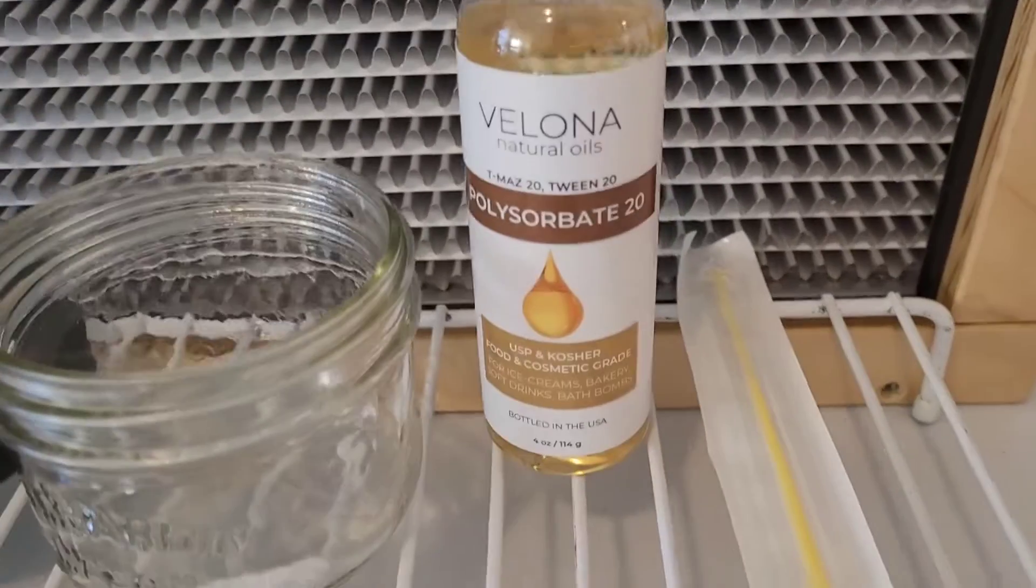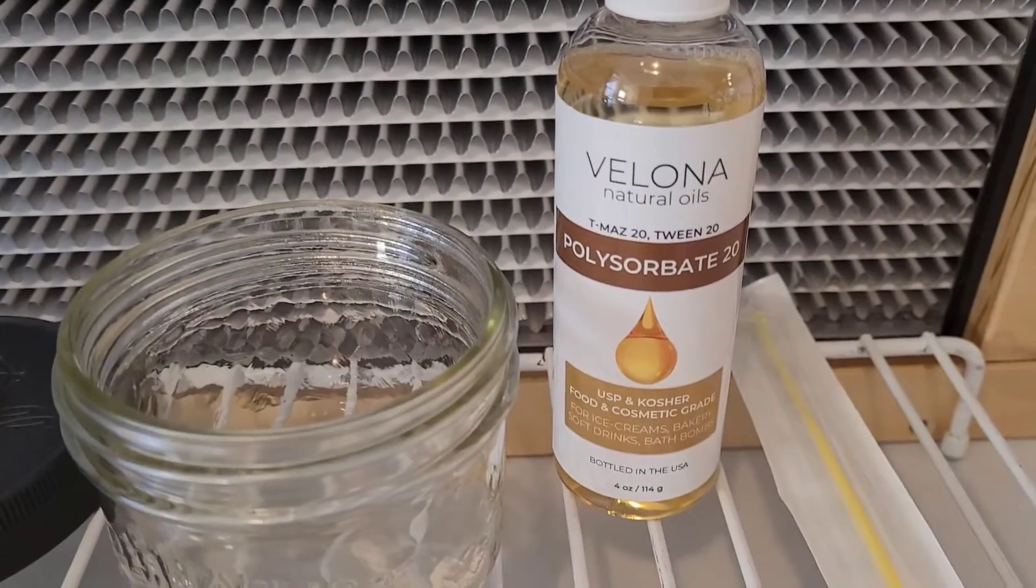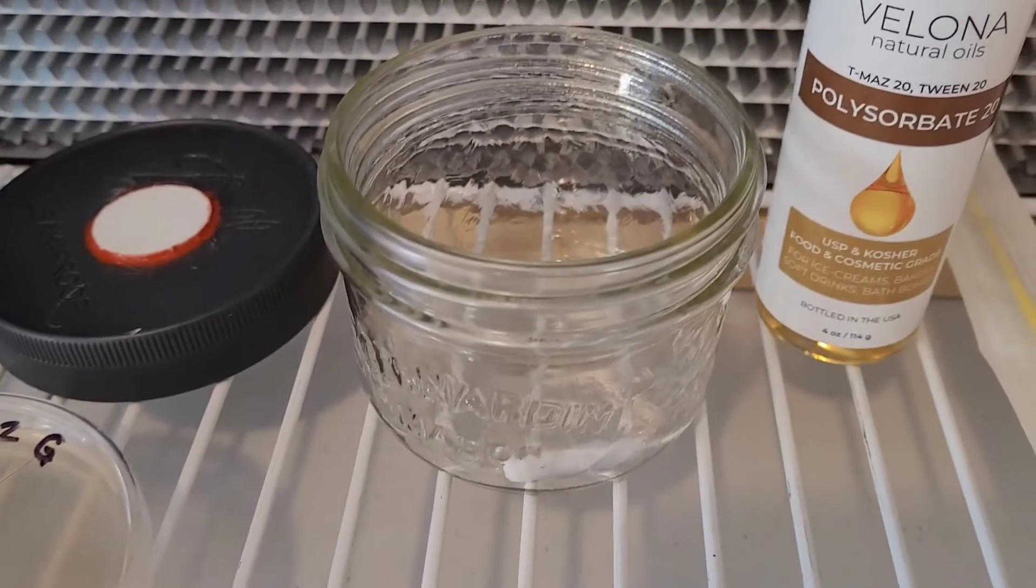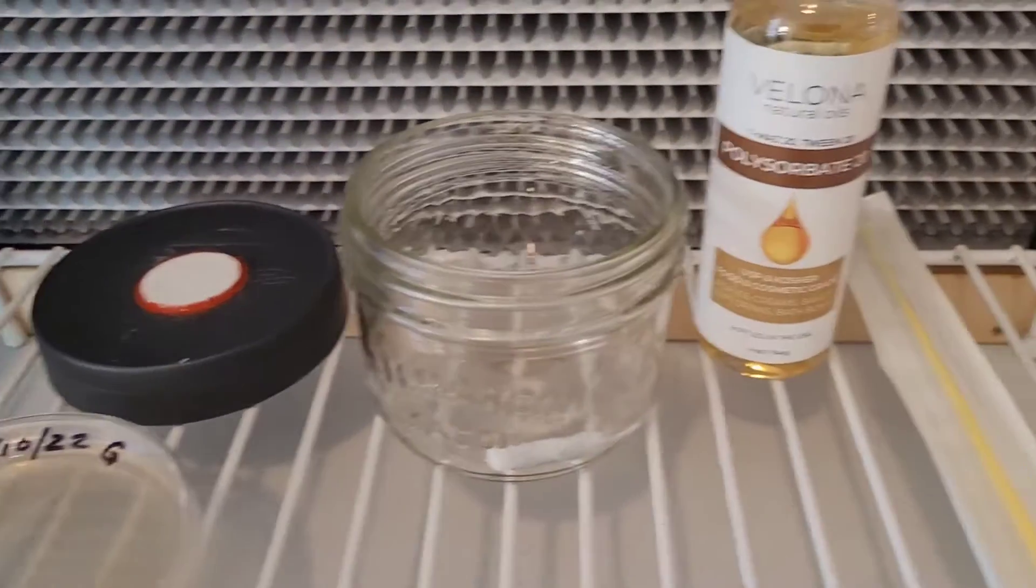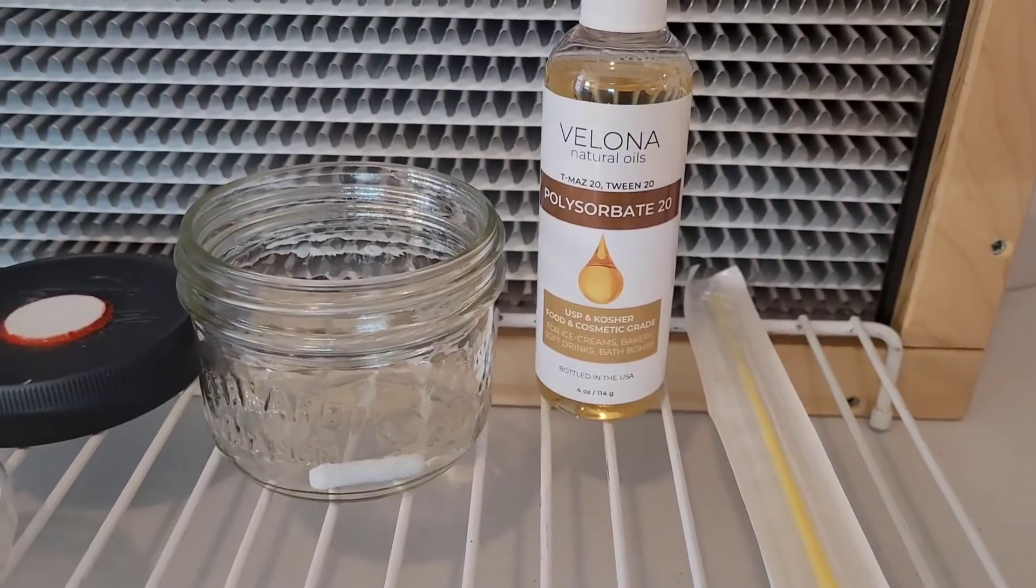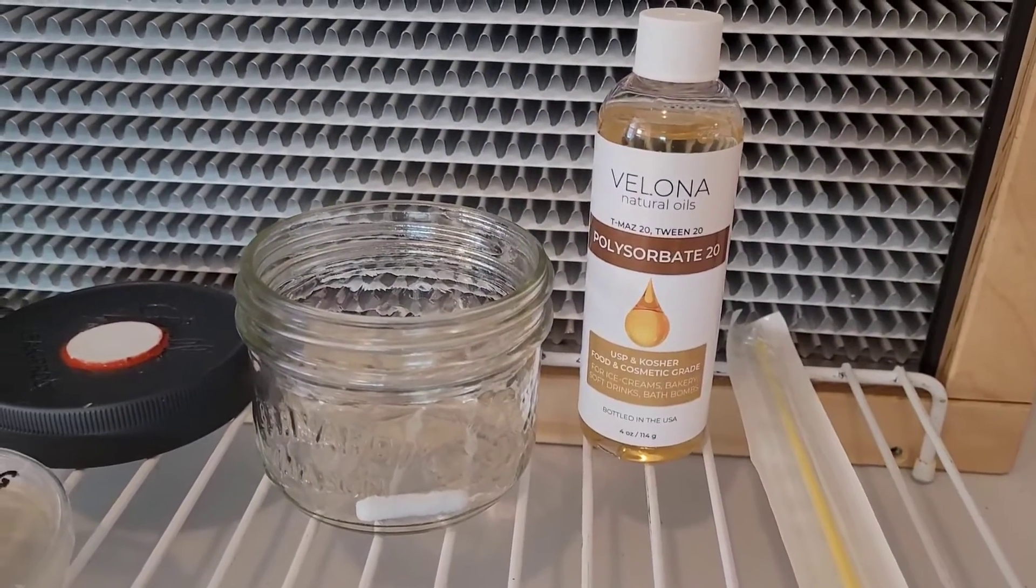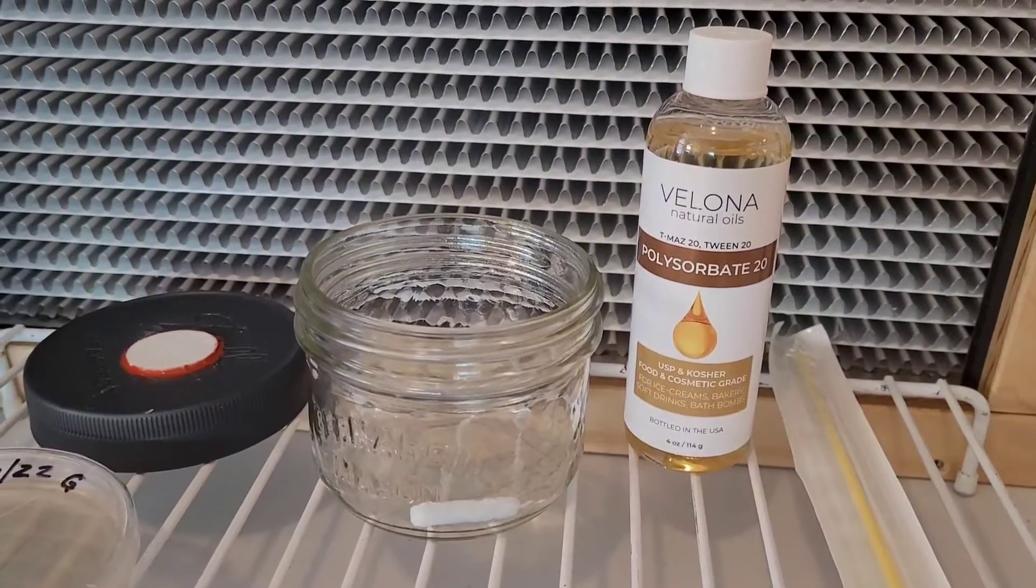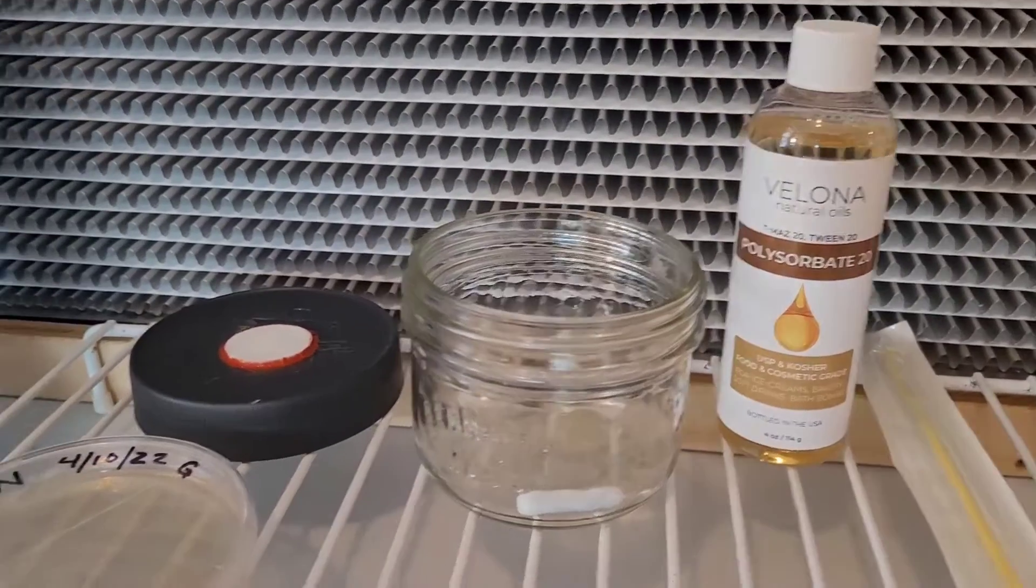The polysorbate 20 is going to be the surfactant. I'm going to add a drop of this to the water to keep those spores from clumping together. If you don't have polysorbate 20, you could probably just use a drop of dish soap as your surfactant.